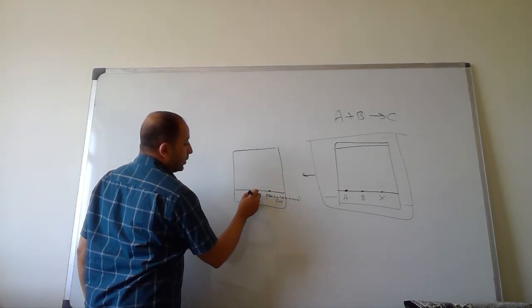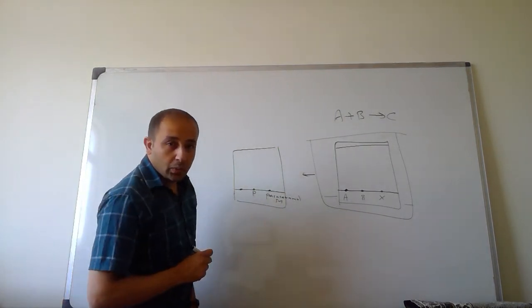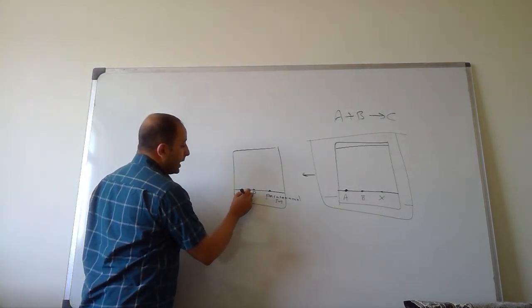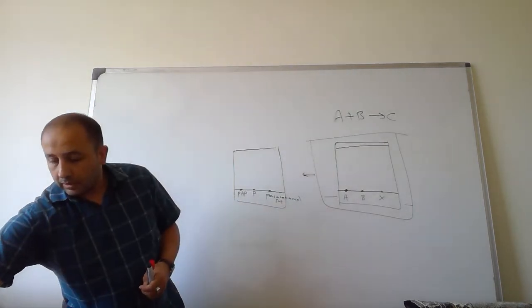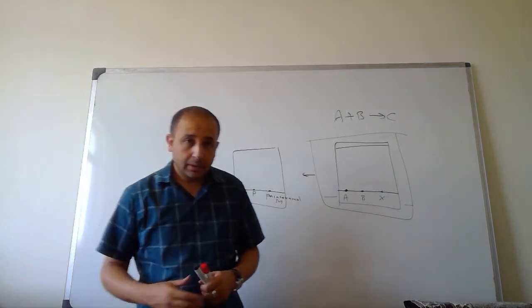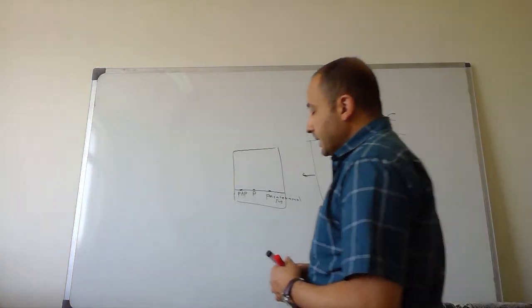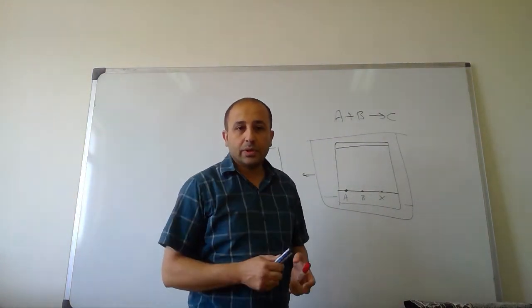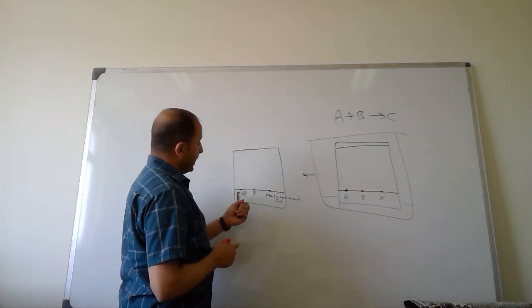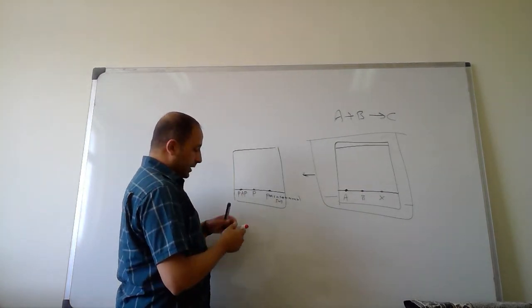Now here we have paracetamol as reference material, as standard, and thirdly we have what? We have para-aminophenol. Now para-aminophenol is the degradation product. So in order to see if we have para-aminophenol in the paracetamol suspension or not, we have the standard material here.